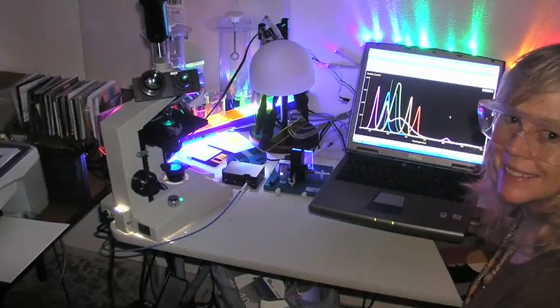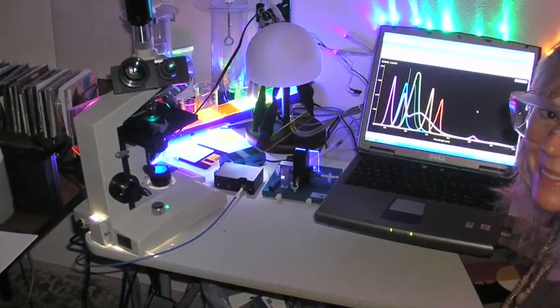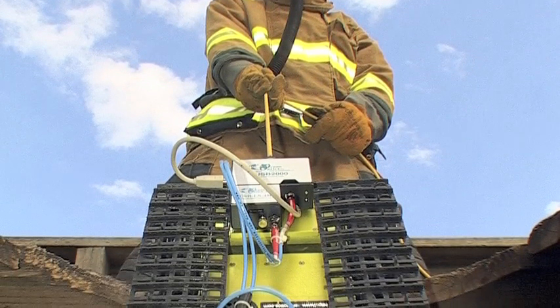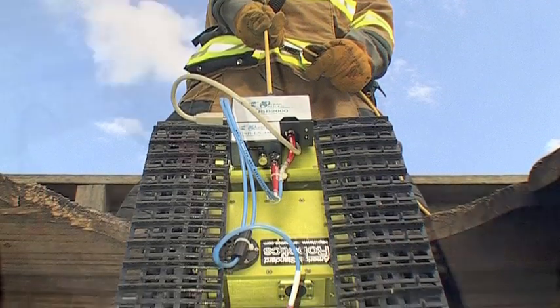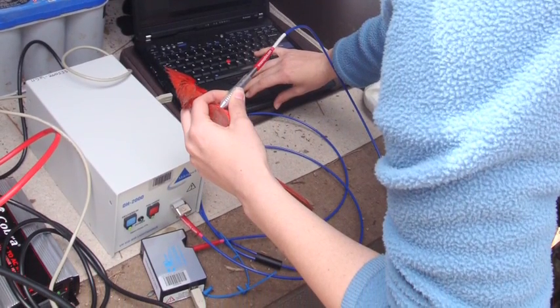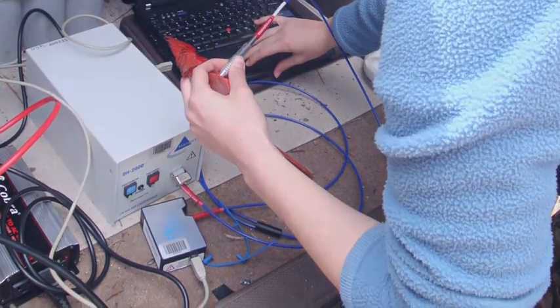The advancements of our USB spectrometers represent the knowledge gained since OceanOptics sold its first spectrometer in 1992. USB spectrometers fit in the palm of your hand. They're convenient, flexible, and simple to use.